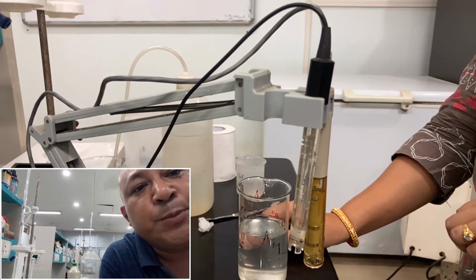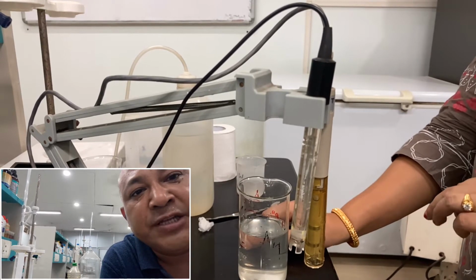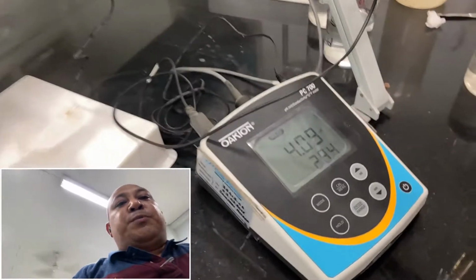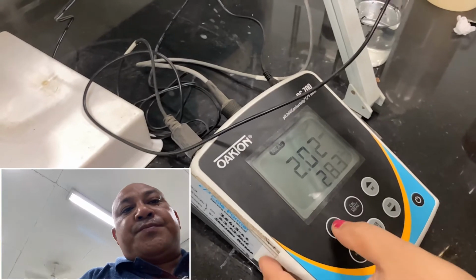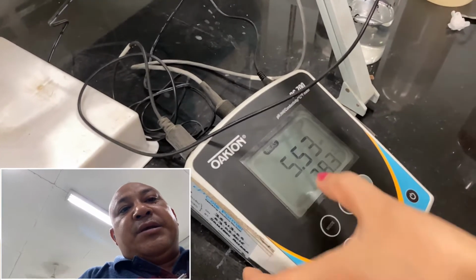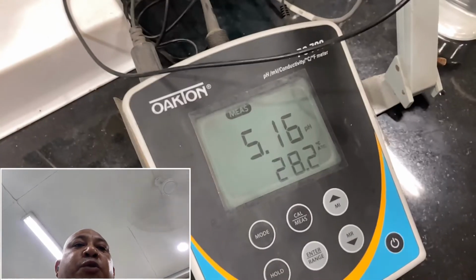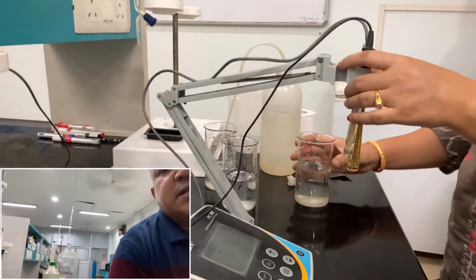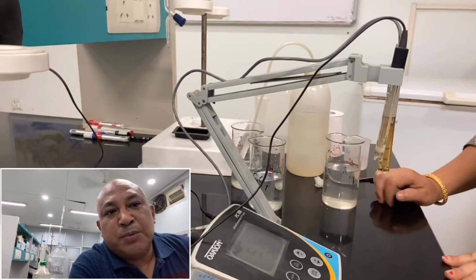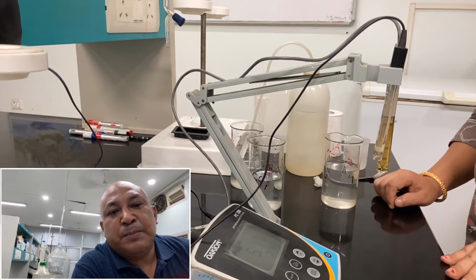We have another pH rod parallel to the system, so we are going to measure the same pH with this equipment. So now we are going to change. Please change to the pH mode. Here we click the mode and now the unit is coming as pH. Right now we are going to measure pH. As we all know, pH is the measurement of the hydrogen concentration of the sample. 1 to 7 we declare as acidic pH, whereas above 7 is alkaline or basic pH.